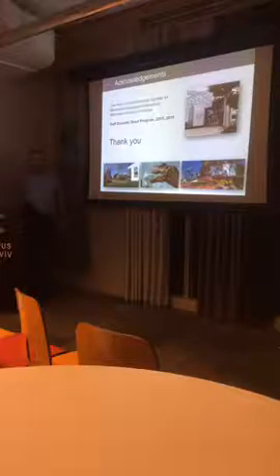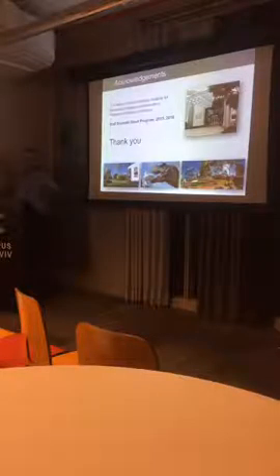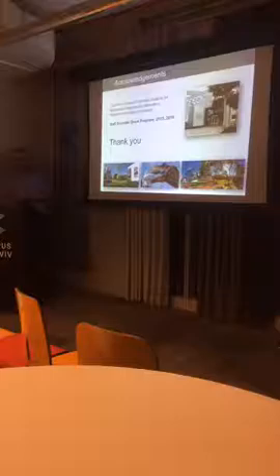There are also fluorescent speckles, but I'm talking about dynamic light scattering. So there's fluorescent speckle imaging, and there is dynamic light scattering microscopy. They are two different microscopy approaches, because fluorescent laser speckles are more like confocal, used for grid illumination of confocal.